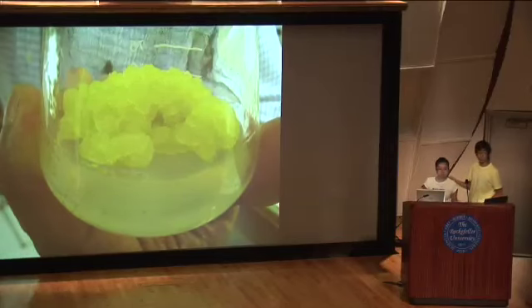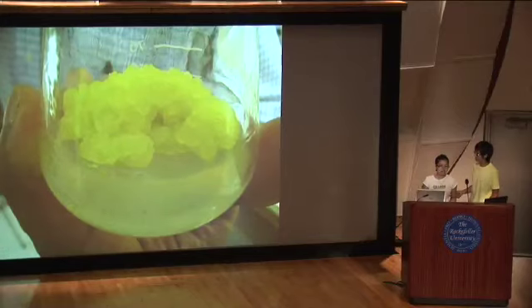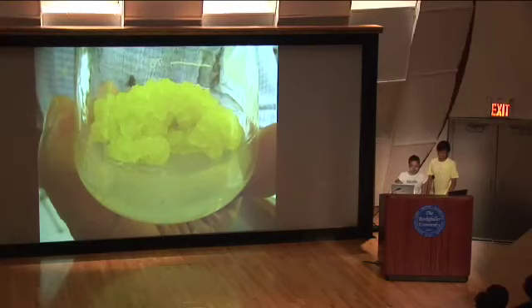This is a glass bottle that the plant samples were put in, and the bottom is the medium that was used to help the plant cloning process. He didn't go through what the medium is because it was already premade for us. It's important to know what the medium is, but we didn't have enough time.